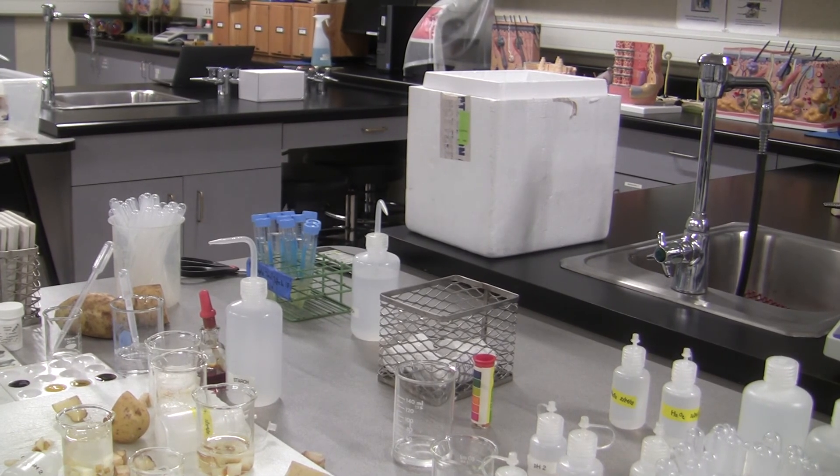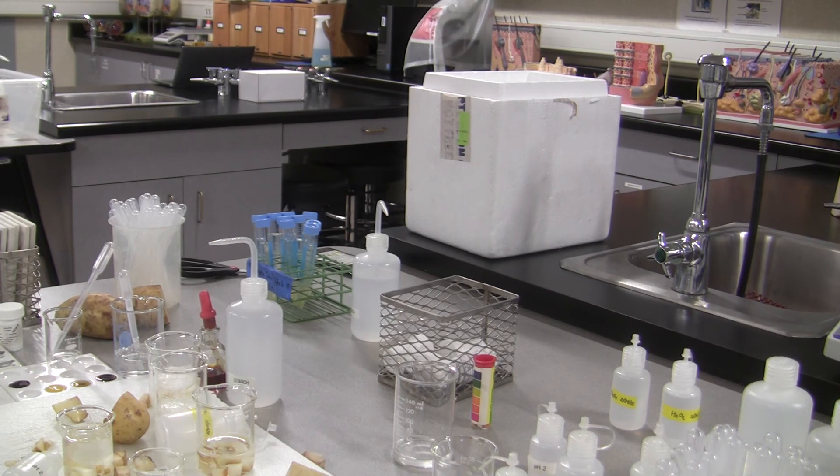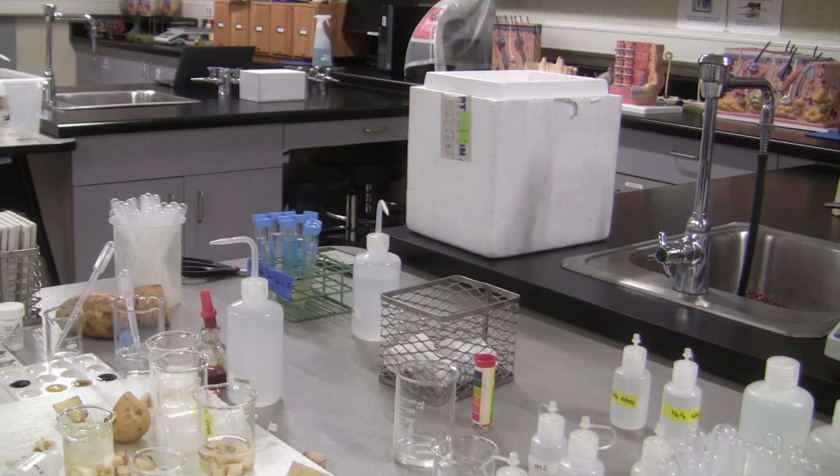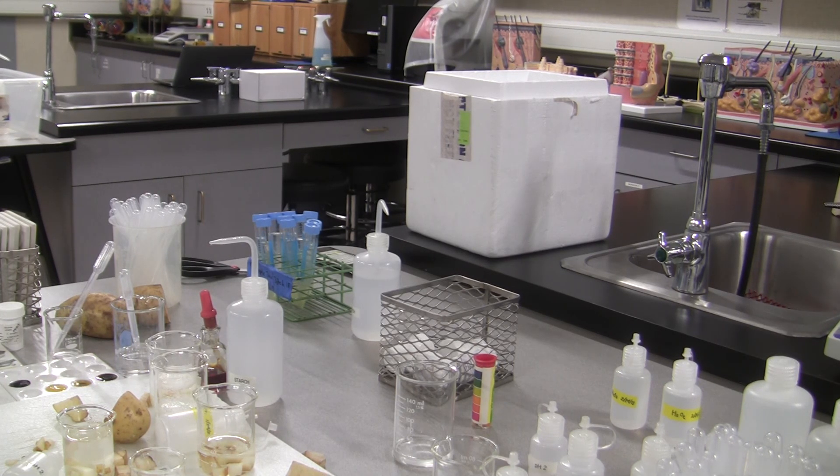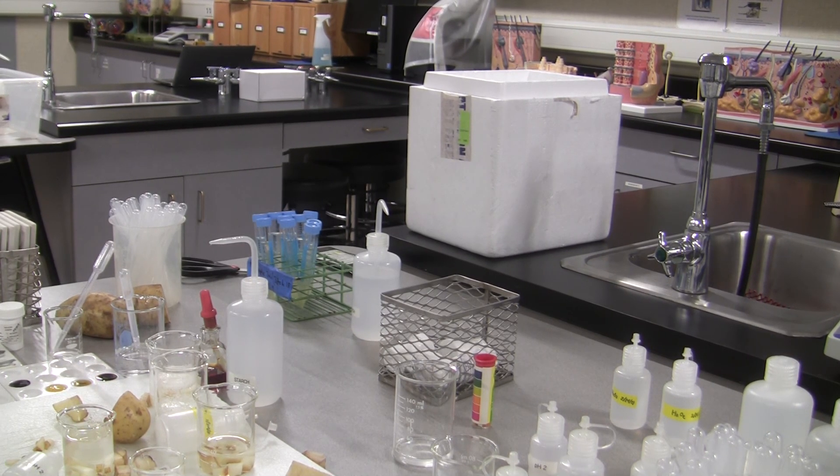All right, so you've seen the experiment on enzymes and there are three enzymes we dealt with: the one in potato, and then of course amylase, and then the bromelain with pineapple. And that's about it. The third one in the potato we can look it up.